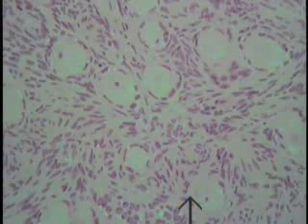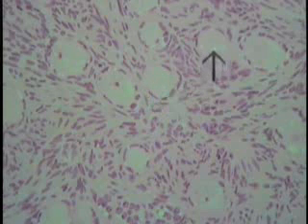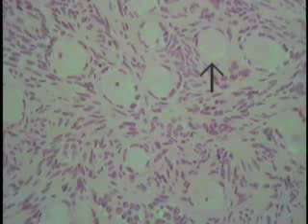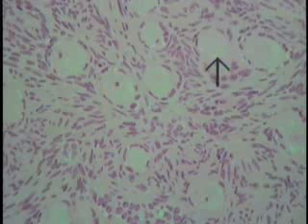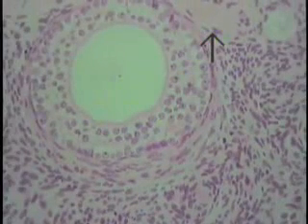Note another feature that is shown in this particular field. Not all of the ova show a nucleus or a nucleolus. In this particular case, we only have a grazing section to the nucleus, and in this section of this oocyte, the nucleus is absent. Absent only from the field of view, because these cells are so large and spherical in shape that once a section comes through them, it may go on either side of the nucleus, and it is not visible in a two-dimensional section. Now, having made those observations, move the field on your particular section and look at yet smaller cells.